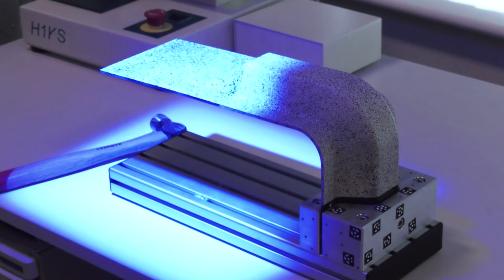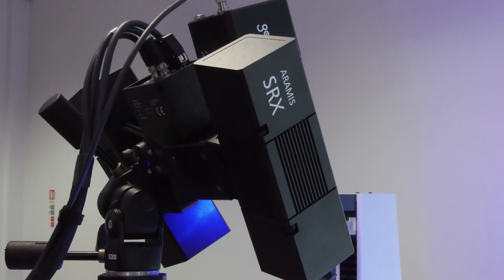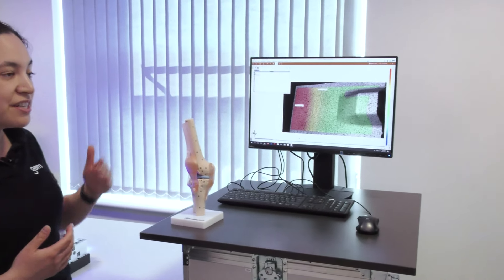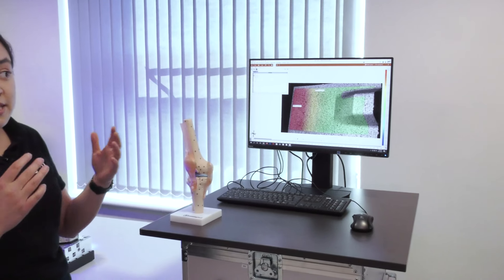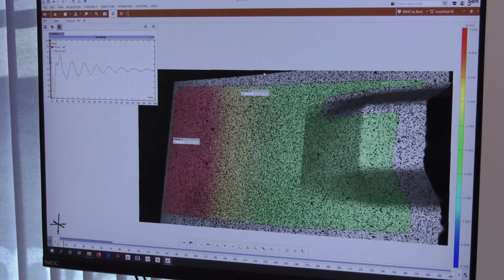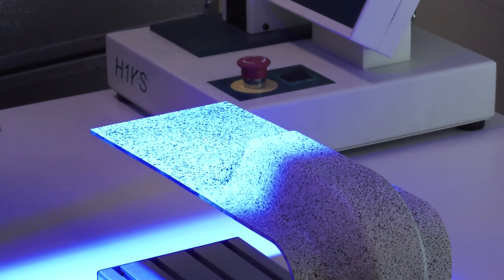When doing a DIC measurement, we need to make sure we've got a speckle pattern on the part. First we prepare the part with a speckle pattern, then we perform the customer's test — whether that's a materials test or a component test — and put their part through its paces to see what happens. We can measure either displacements on the surface or strains.